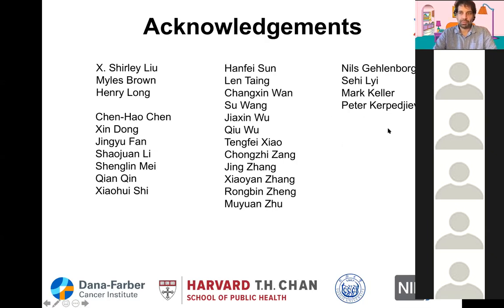Thank you for this. I was wondering if you could say something about the export of the data results. For most of the tools, for example LISA, you can download all the results, and I would recommend that because we leave it up on the website, but probably for a month. We're not going to keep it forever, but you can download the files. And I think for all of these analyses, you can download the results. Okay. Yeah.